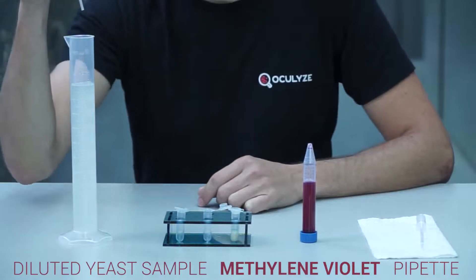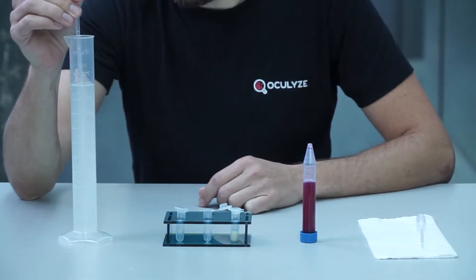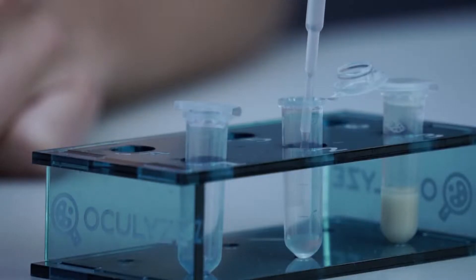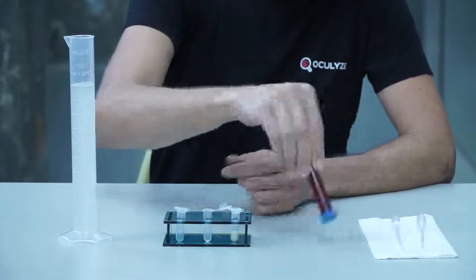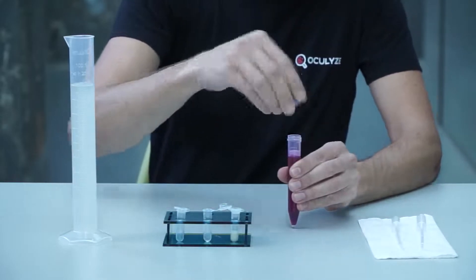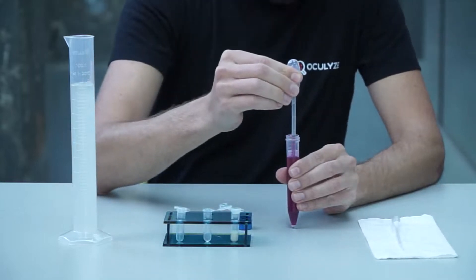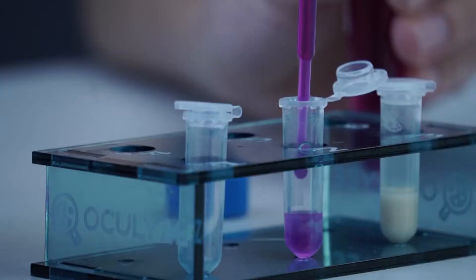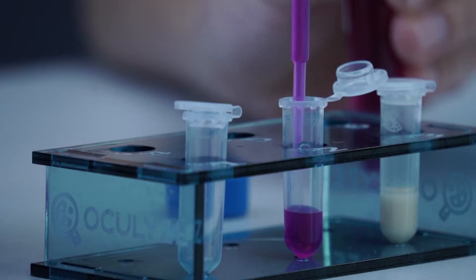Take 0.5 milliliters of the diluted yeast sample and put it into the reaction tube. Then take 0.5 milliliters of methylene violet solution and put it into the same reaction tube. Mix the samples by running the solution in and out of the pipette a few times.